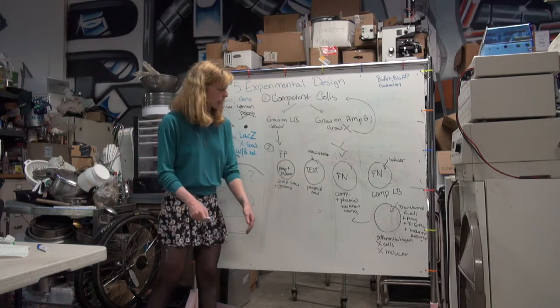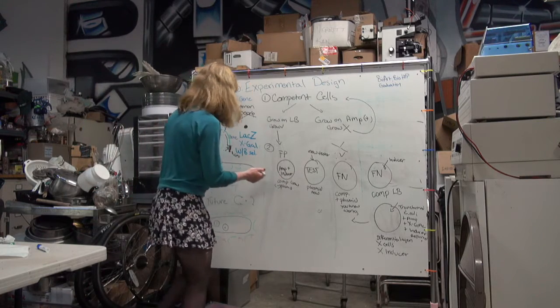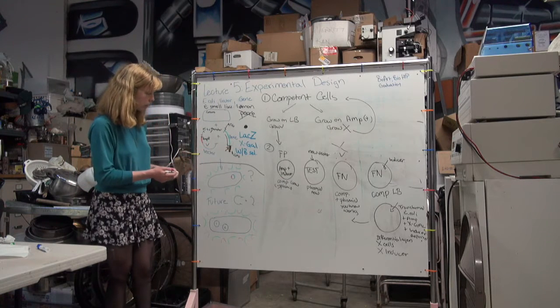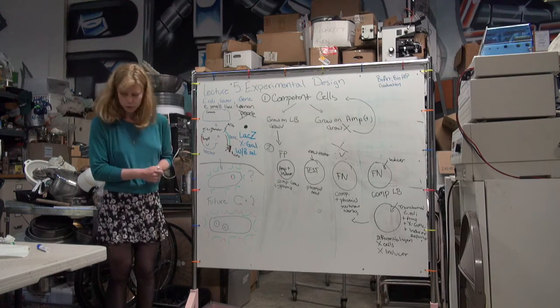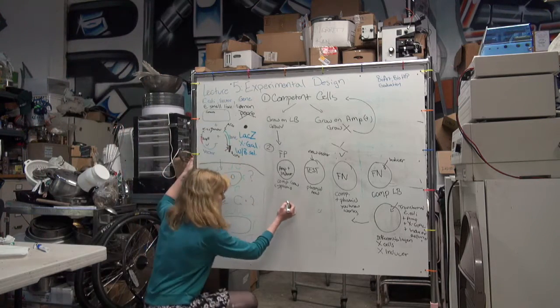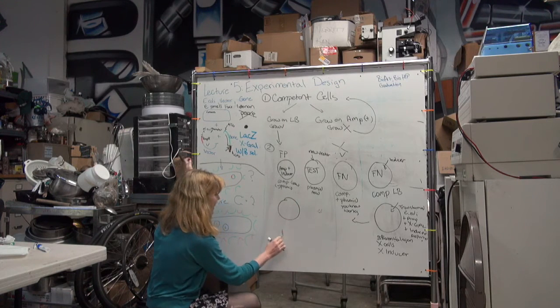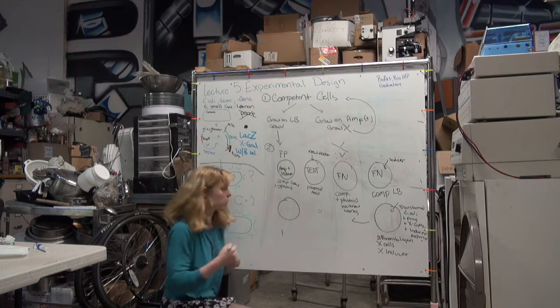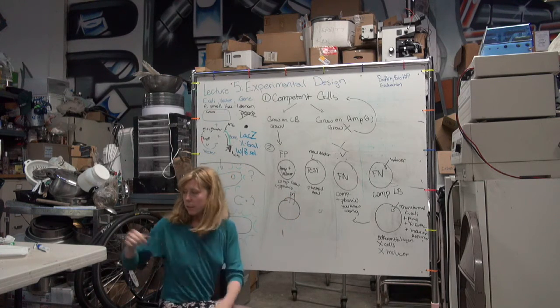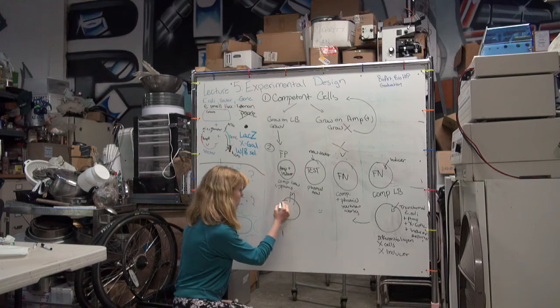Our new plasmid is going to be differentiated from anything we don't want. So in this case, remember what we don't want is blue cells, because we'll have, draw our plasmid for us again. This other circle is a plasmid, it's not a petri dish. We'll put little stripes in it, and our ori.